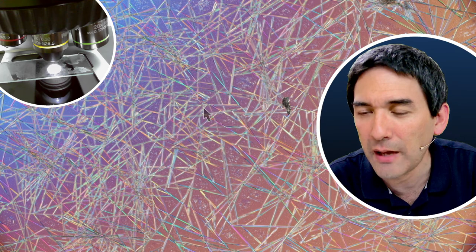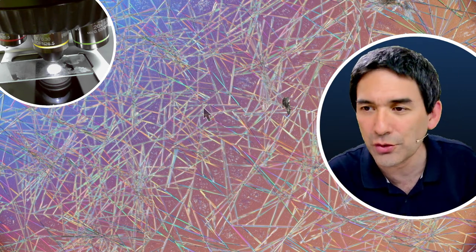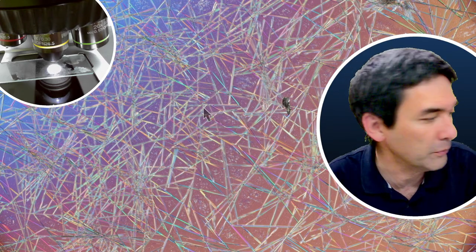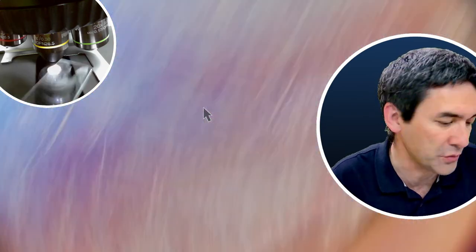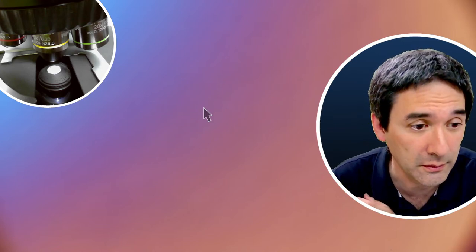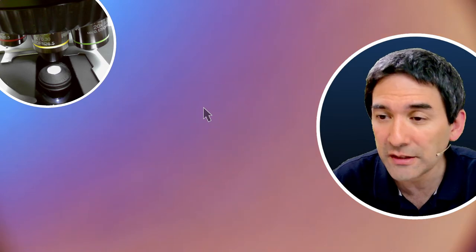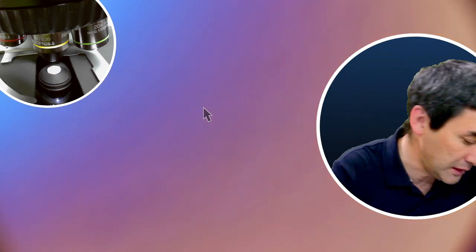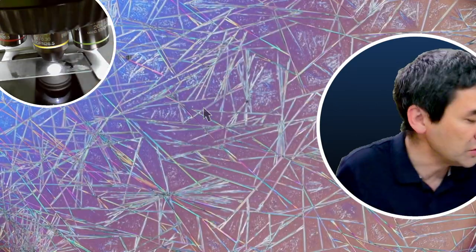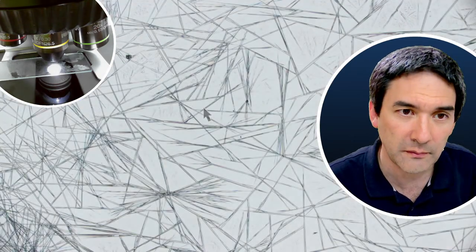So some people are asking, hello, what are we looking at? Well, today I'm putting some crystals under the microscope again, with some polarized light. Most of the time I'm using my stereo microscope for this. So let's try some aspirin now. Where is the desk view? How does it look under bright field only? Okay, thank you for the comment. This one here is now using DIC, using polarized light. So on the bright field, it looks like this.